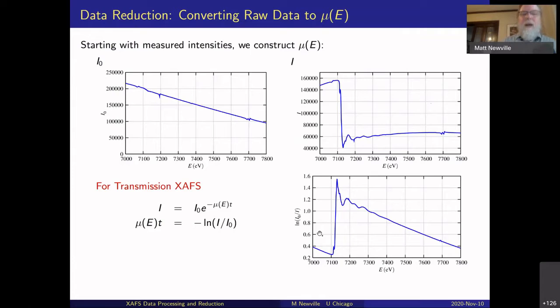When we said I0 over I1, we meant the intensities, and these are counts, or even voltages or currents from an ion chamber or from a detector. It turns out that if you are using ion chambers, or even most detectors, the effect of not converting that to real intensities is not very big.